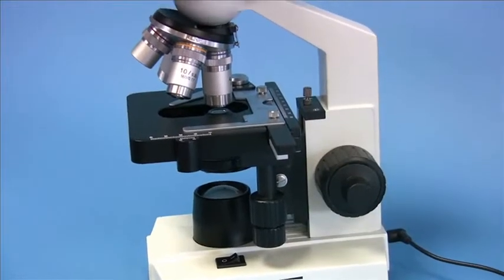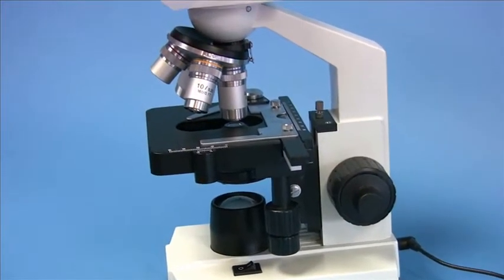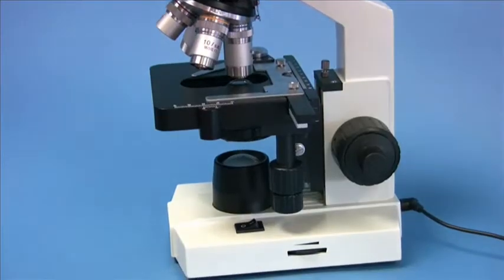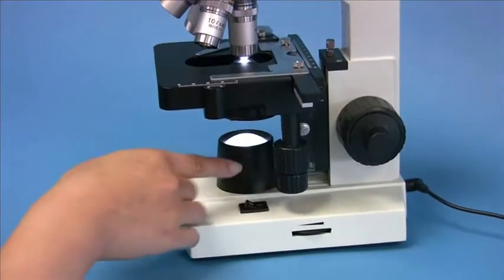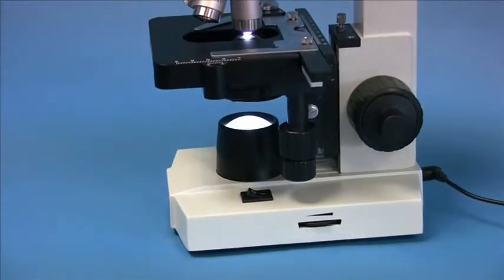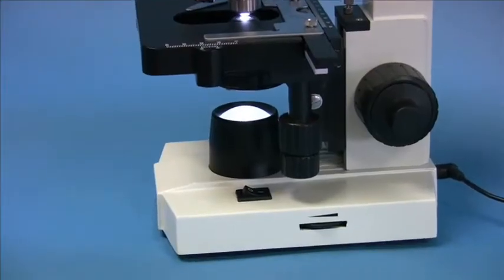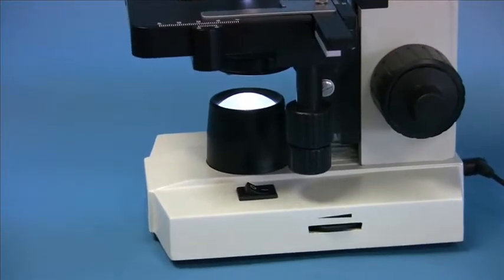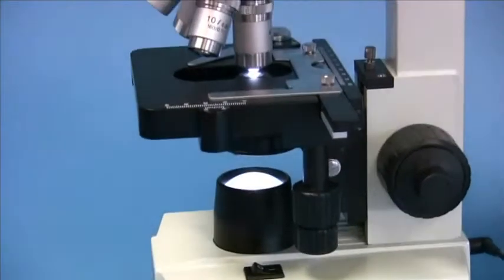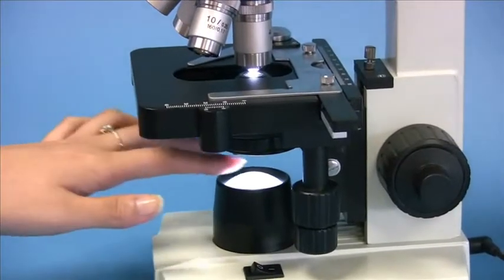As for the illuminator, this model is equipped with LED light. In addition to its long lifetime, the LED bulb produces an evenly distributed light and barely any heat.